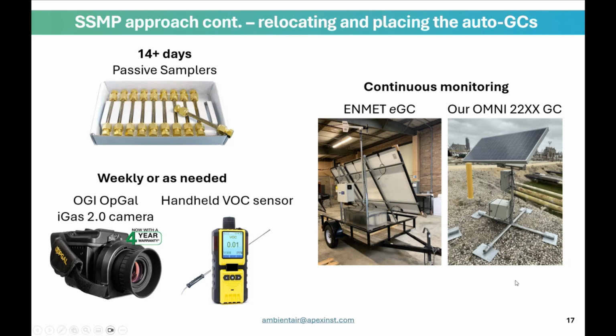And I wanted to take this opportunity to highlight an important distinction: when you're monitoring in the field environment, it's often important to utilize multiple different technological approaches. I often talk to folks who are looking for a silver bullet, and there is no single instrument that can do it all and fits all of your constraints. So it's very important to remember that each technology inherently has advantages and shortcomings. But to achieve a specific goal, you have to select the right combination of appropriate tools and technologies. And I think CITGO does a really good job in this SSMP of doing that.